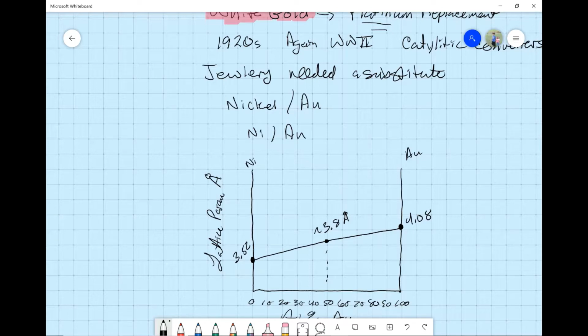One other thing, if you do XRD, okay, and you're getting two distinct peaks, and the d-spacing of 1, 0, 0 matches either nickel or gold, and you don't see anything else, then that means you're not really alloying at all, that it's a non-alloyed mixture.